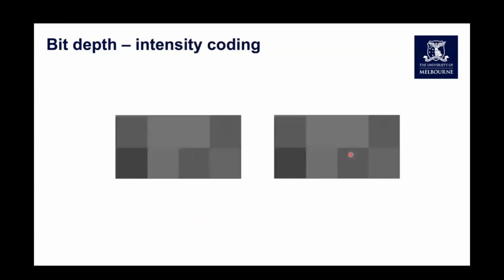Why is this important? So if we look at these two examples of a 4x2 array of pixels, one is acquired on an 8-bit scale, so between 0 and 255 grayscale values. If you look at the 2 pixels here, they essentially have identical intensities. Whereas data which is acquired at a 16-bit setting, we can actually now see there is different intensities between these 2 pixels. This becomes very, very important downstream when we're doing image quantification to allow us to separate out different objects within the image.